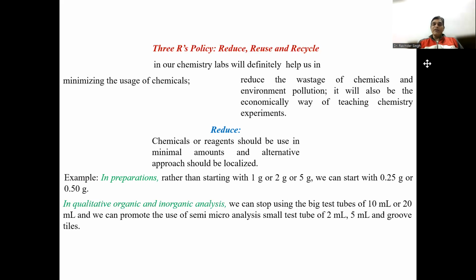During qualitative organic or inorganic analysis, we can stop using big test tubes of 10 ml or 20 ml. We can put a very small amount on a tile, a particular tile designed for the chemistry laboratory.